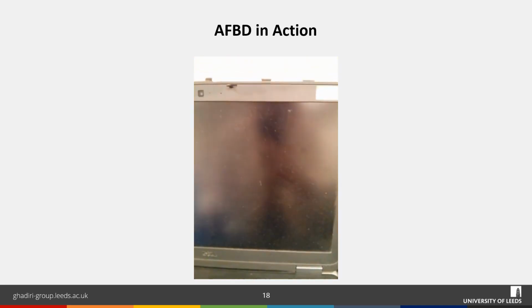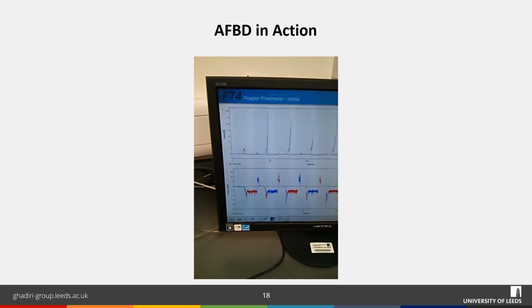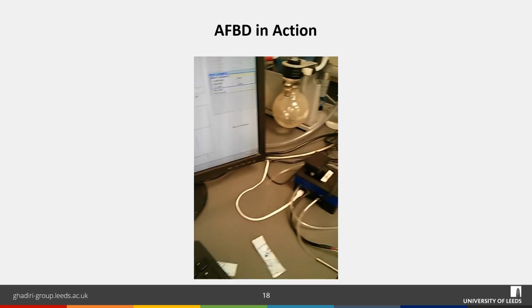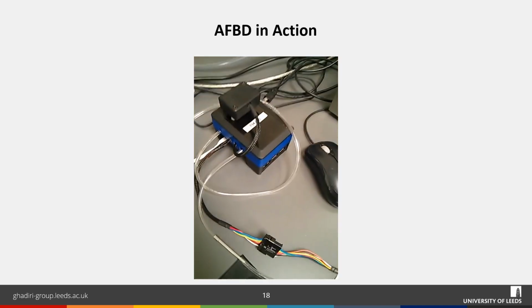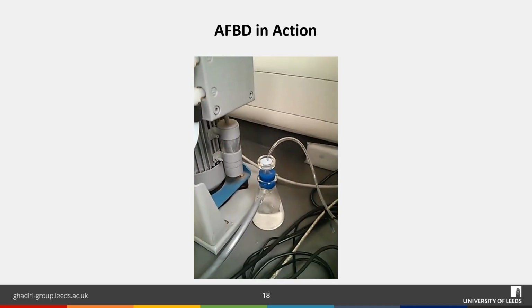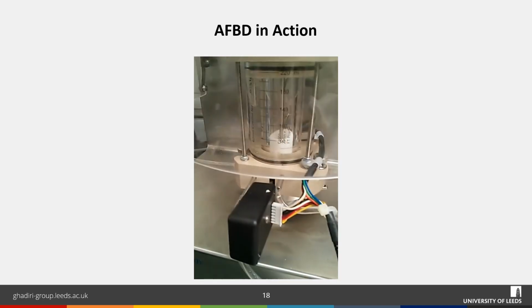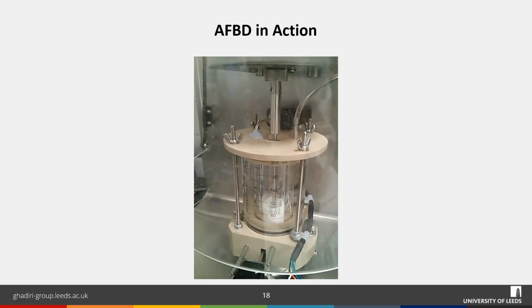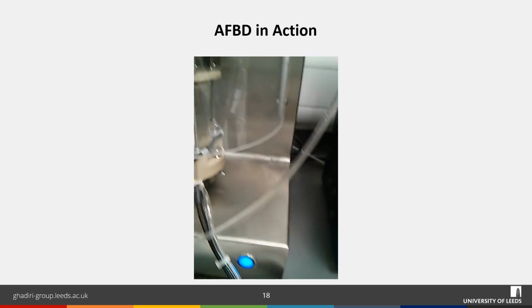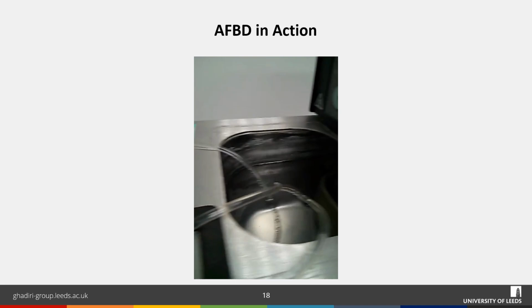This is a video showing the AFBD in action. So we have the FT4 software, as you can see here, which is connected to a Raspberry Pi for collecting the sensor data. And the FT4 rheometer is connected to a vacuum pump for filtration. As you can see here, we have the test rig that we've designed, which is in action now, and it is connected to a mini water pump and a water bath which circulate the hot fluid.